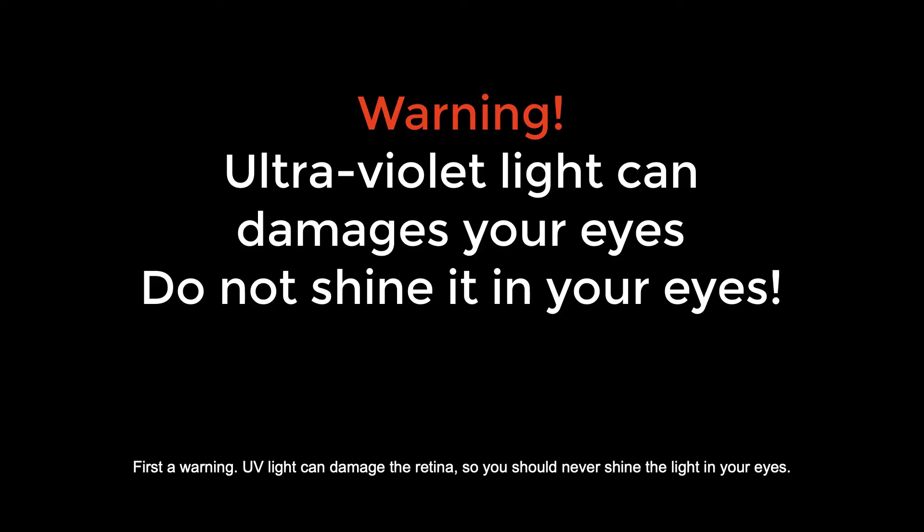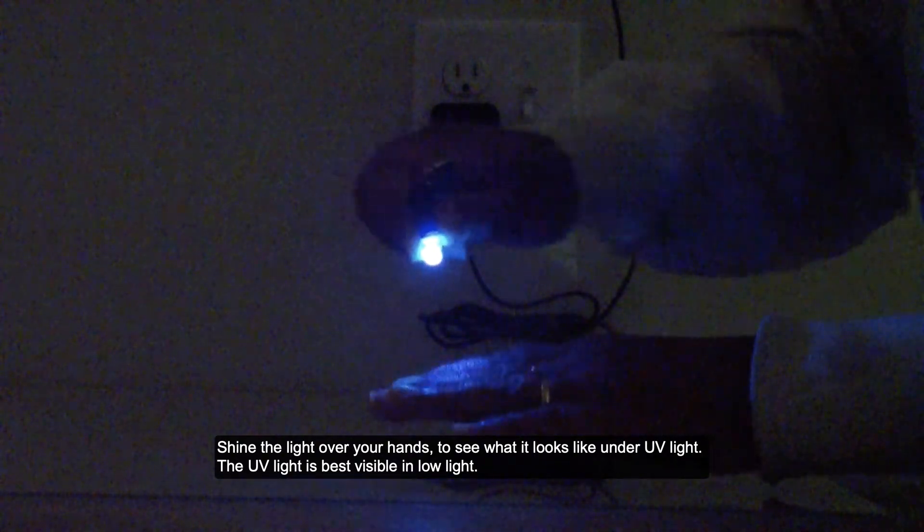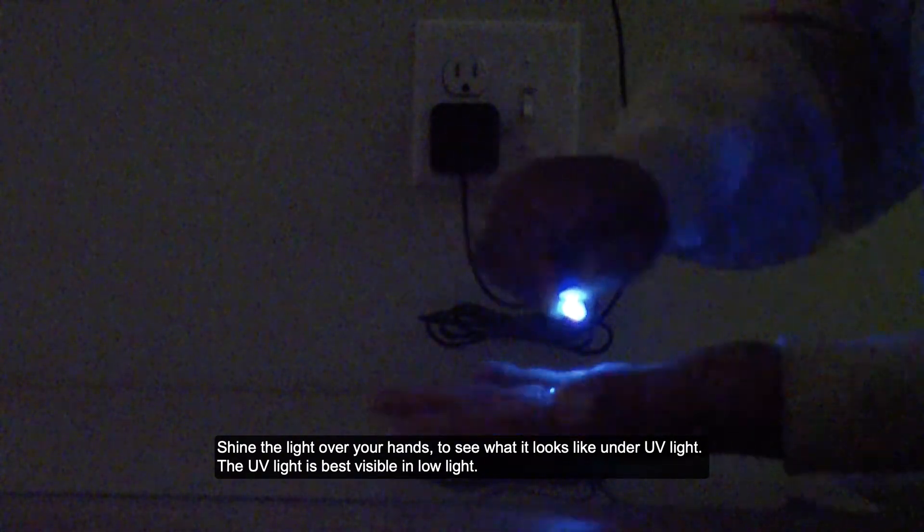First, a warning: UV light can damage the retina, so you should never shine the light in your eyes. Shine the light over your hands to see what it looks like under UV light.